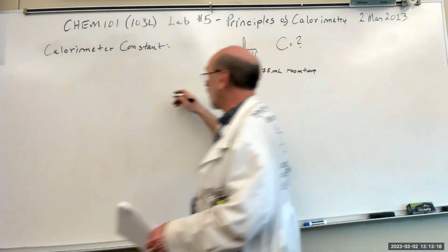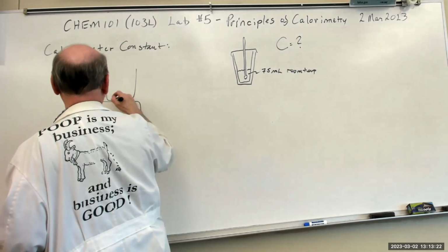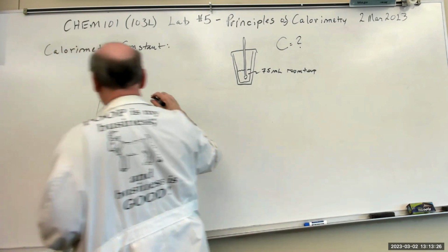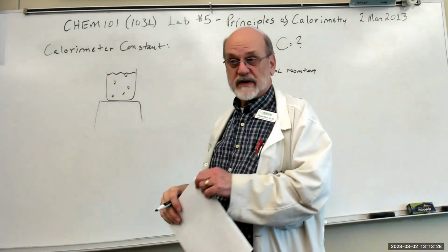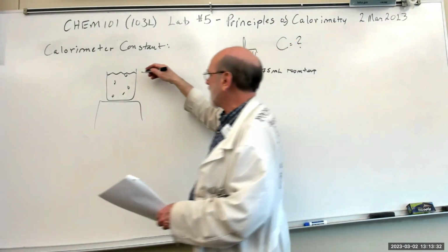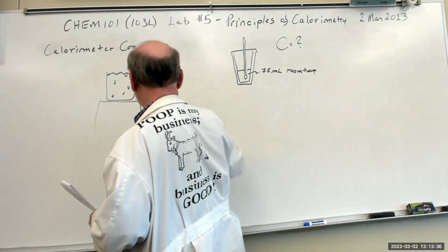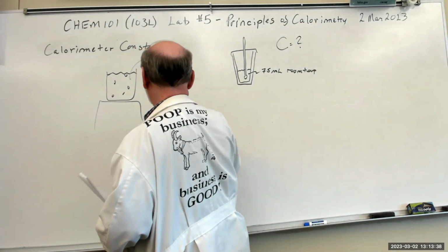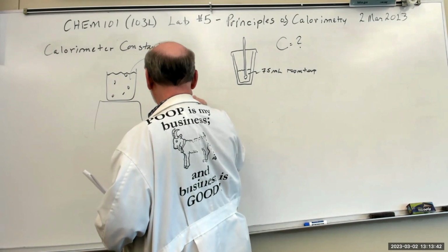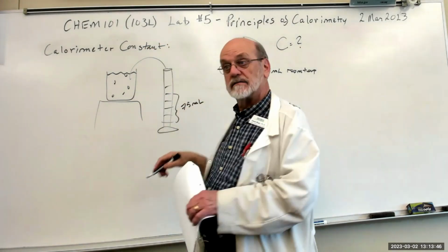And then you're going to have some boiling water over here on a hot plate. It won't be 100 degrees. You're going to have to measure it. So you'll take out of this, you go into a graduated cylinder, right, with its markings, and you want 75 milliliters here of boiling water.